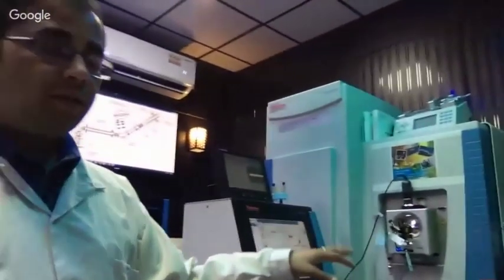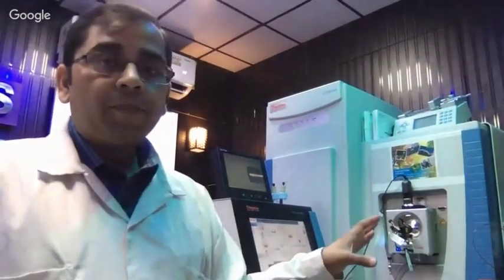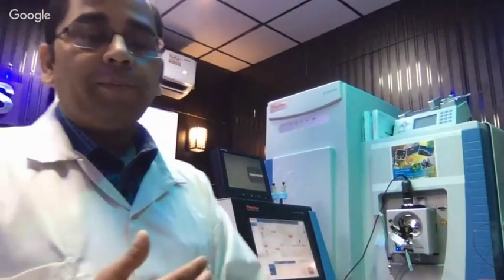In this case, we have this particular instrument, the Q Exactive, which has two different types of mass analyzers, quadrupole and Orbitrap. In the Fusion, you have three different mass analyzers, which is known as tribrid. These kinds of instrumentation can be very useful for doing MS analysis or even MSn analysis, which can give you a detailed idea of the peptide sequences of a given protein, which is not possible if you just do MS1 analysis or only MS analysis.